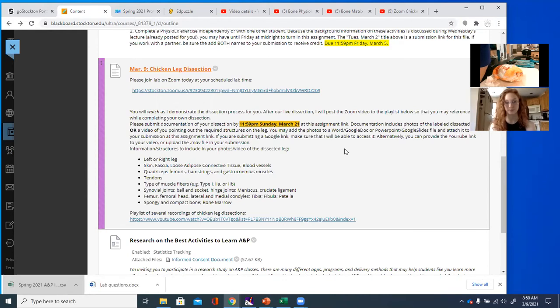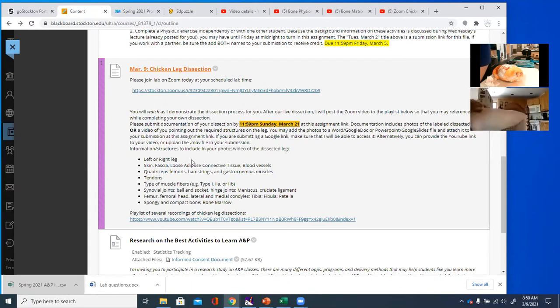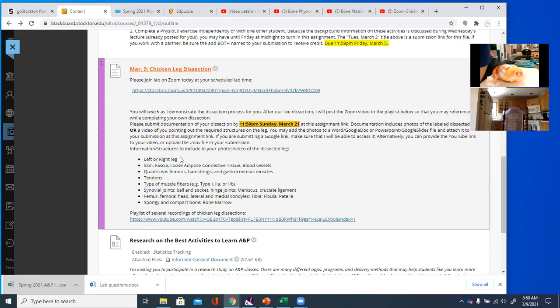So what exactly are we looking for? I want you to tell me whether it is a right or left leg — this gets confused all the time. On the upcoming practical, you'll have to identify right and left sides, so start getting used to that now.